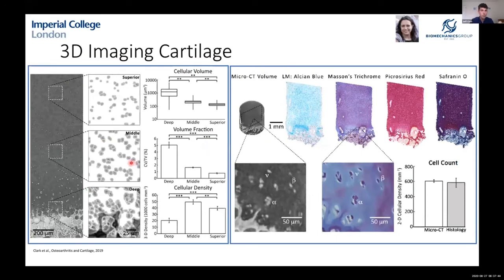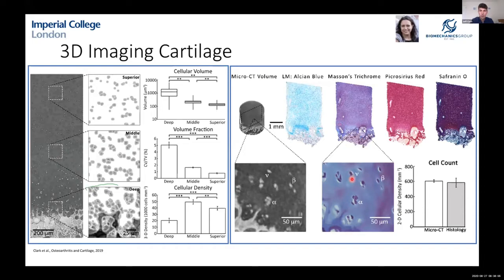Moving to the images we collected — we were able to image across the whole cartilage height and carry out analysis of cell volumes and densities. We also performed histology on the same samples, allowing us to compare micro-CT with histology and match features between the two.